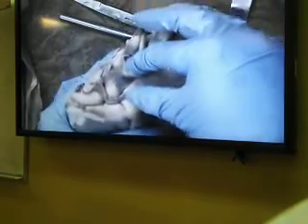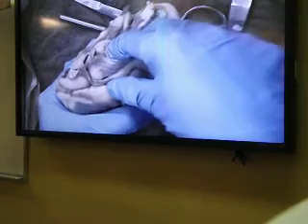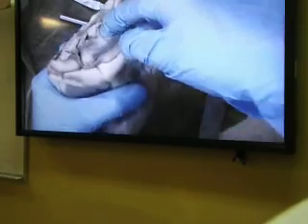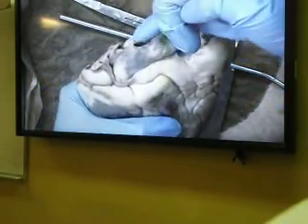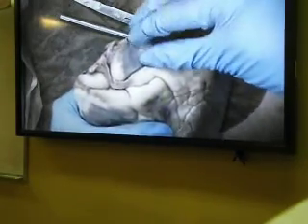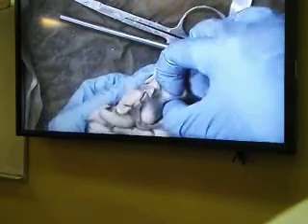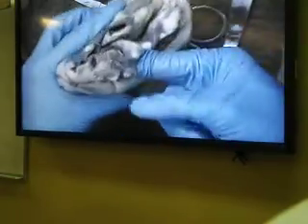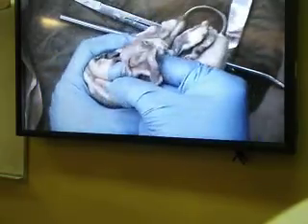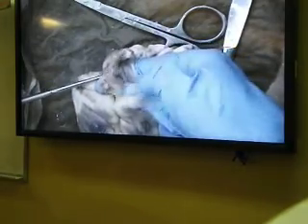So I usually try not to put a probe through the veins, because you may accidentally make a hole in the wall of the vein because they are so thin walled if you are not careful. So usually I use my little finger or index finger to go through the vein. So here is one hole by the right atrium, and I push my finger through it, and then I want to see where my finger is coming out. And if I go right, here is my finger coming out. So then once I find that, I can push a probe.